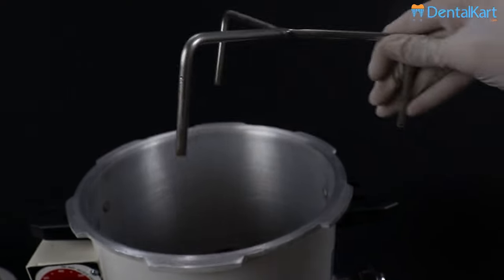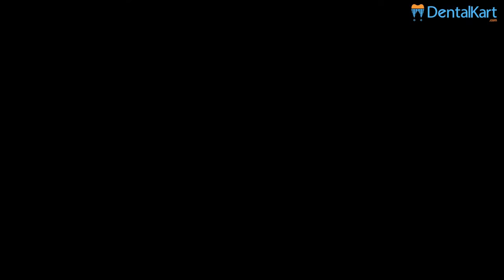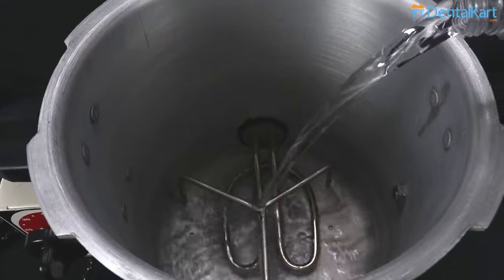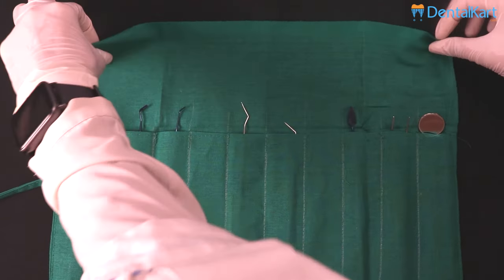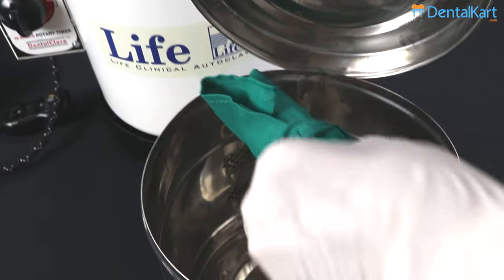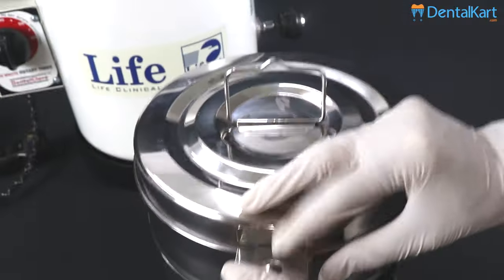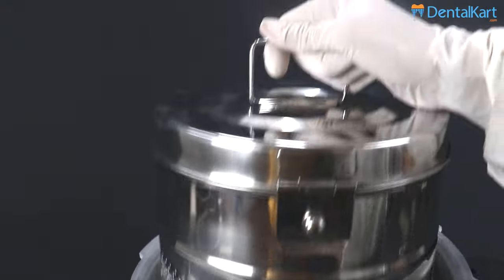First, place the stand inside the chamber. Now, submerge the chamber with distilled water. Then, keep the instrument inside the green cloth, and place the green cloth inside the drum. Then place it inside the autoclave chamber.